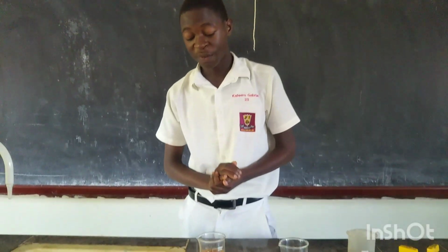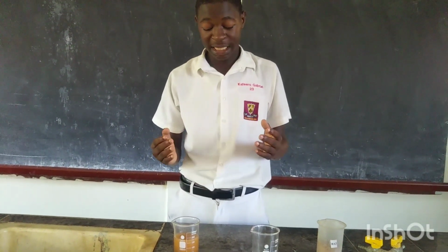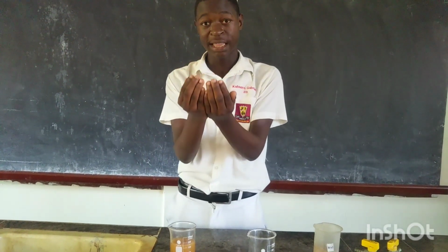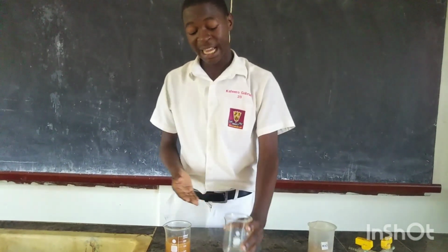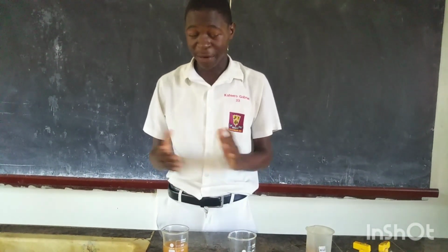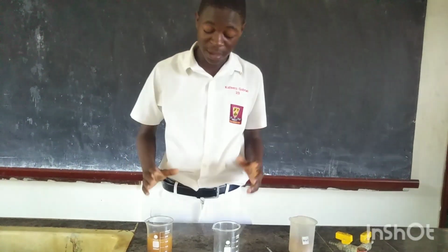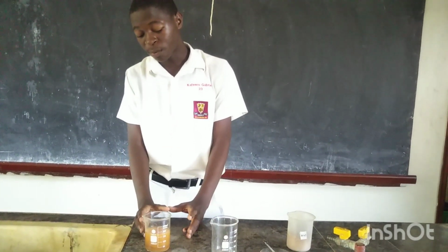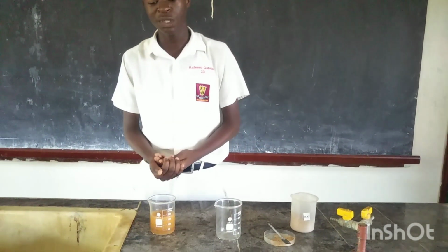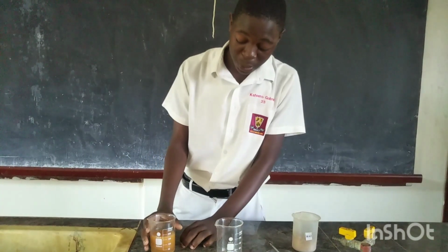Remember, for our experiment to succeed, we first need to wait for a few minutes for the sand particles to stay at the bottom, such that I can get this upper water, which I've just mixed with sand, and drop it into my empty beaker, and I get my results of the sand and water, because I've just mixed them in one beaker. So I just need to wait for a moment. By waiting, you can see the result it has given us. The sand has remained at the bottom.